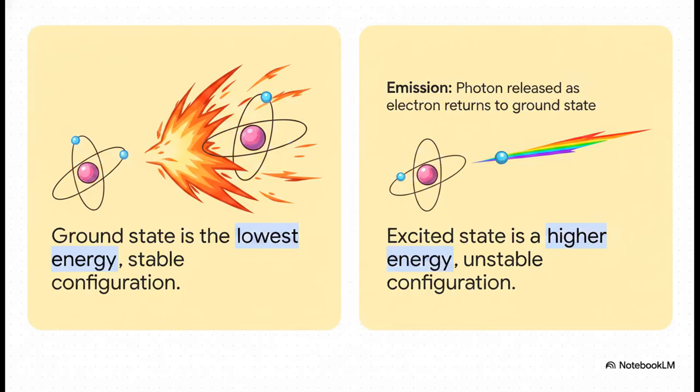And here's the core theory of how that works. You have your atoms in their lowest energy, most stable configuration, right? The ground state. We come in and blast them with intense thermal energy, which promotes their electrons to a higher, highly unstable, excited state. But because nature absolutely loves stability, those electrons don't stay there. They spontaneously fall back down to the ground state. And as they drop, they emit a photon, whose energy exactly matches the difference between those two states. That specific energy dictates the precise wavelength of the light. Boom, you've got your elemental fingerprint.